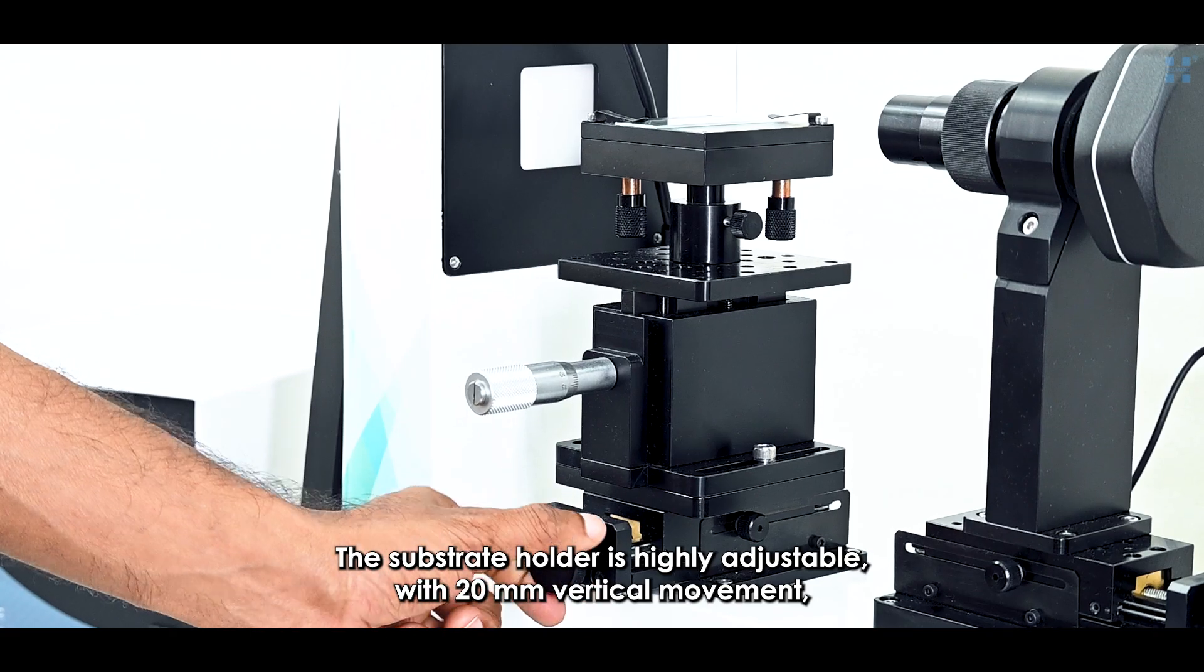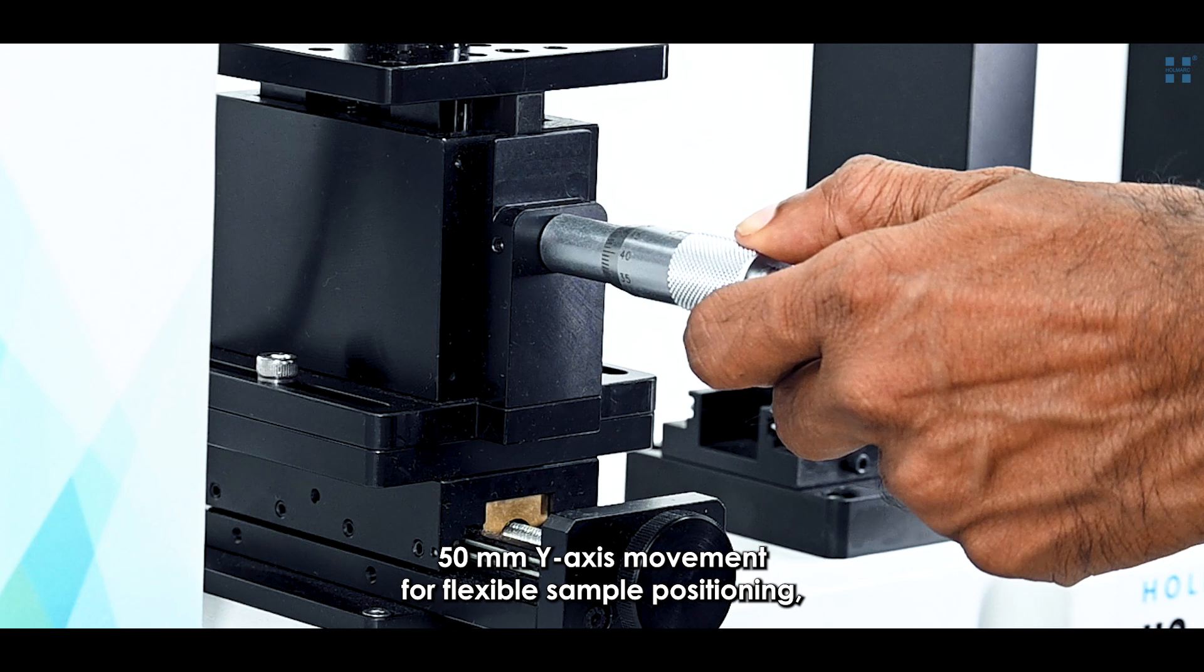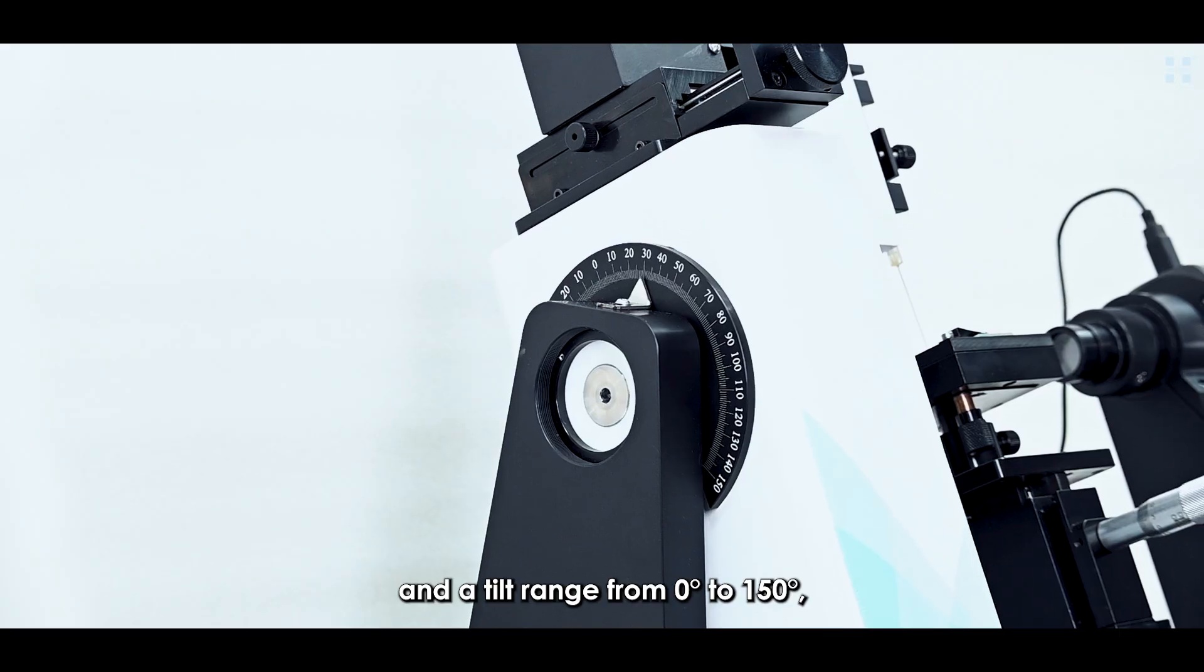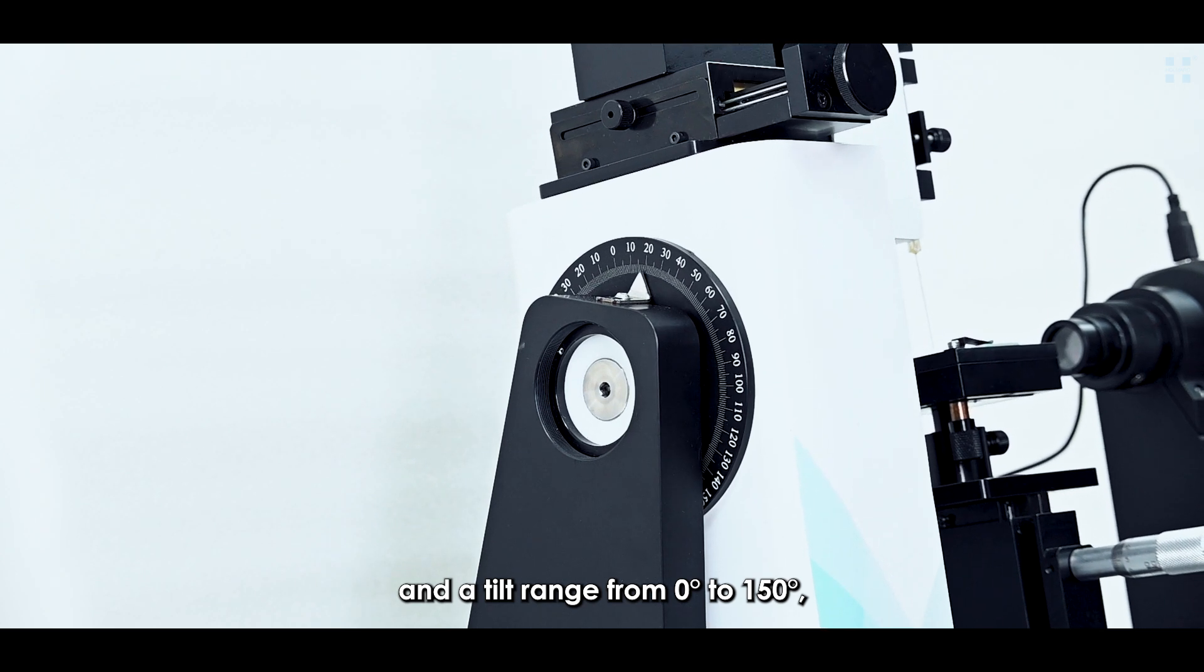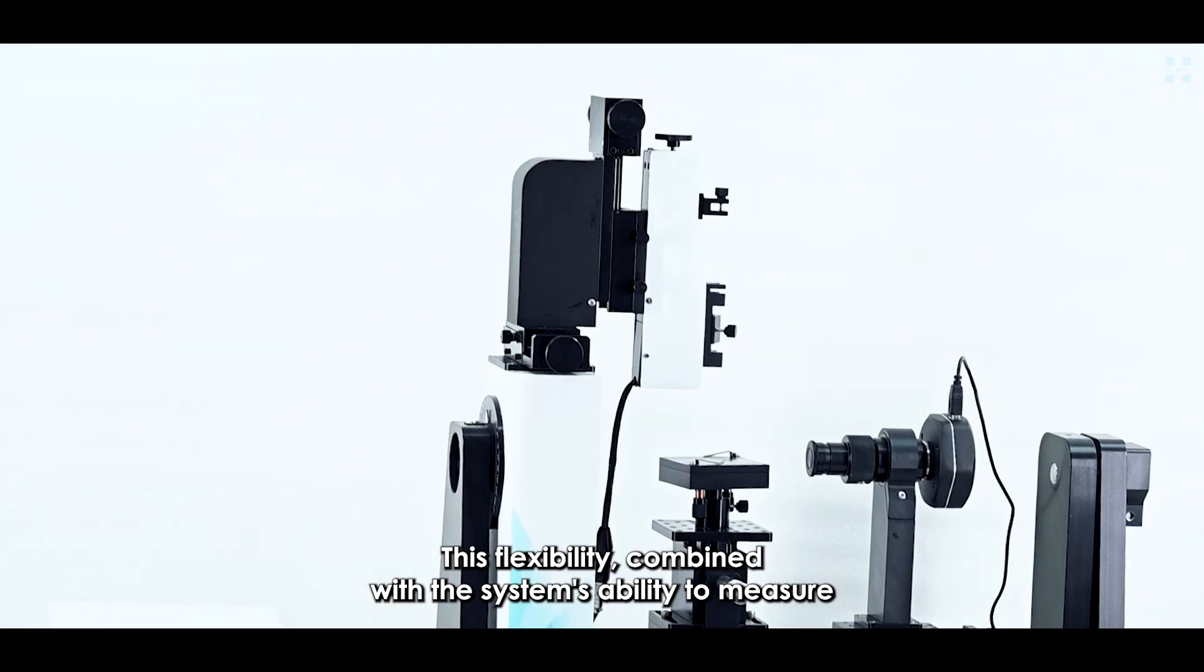The substrate holder is highly adjustable, with 20 mm of vertical movement, 50 mm of Y-axis movement for flexible sample positioning, and a tilt range from 0 degrees to 150 degrees, enabling precise measurement setups.